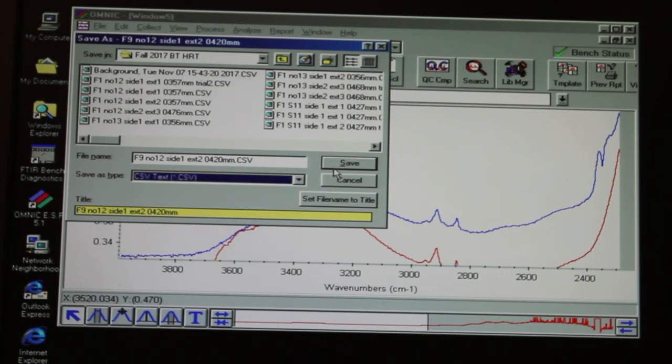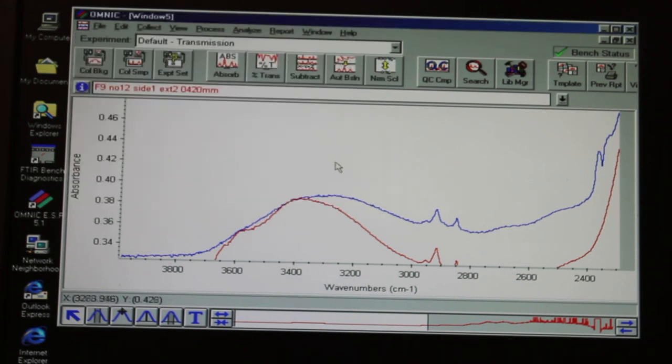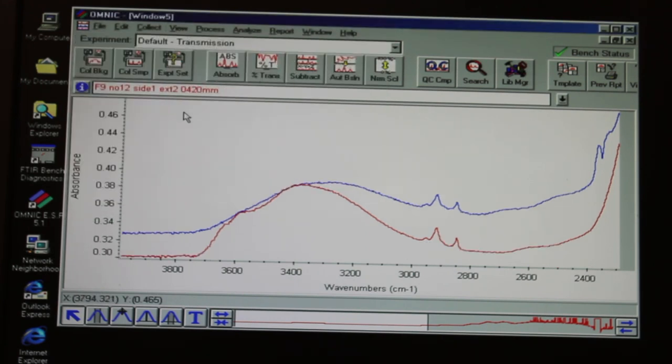You can also go to View Common Scale to compare your spectrum to other data you've collected.